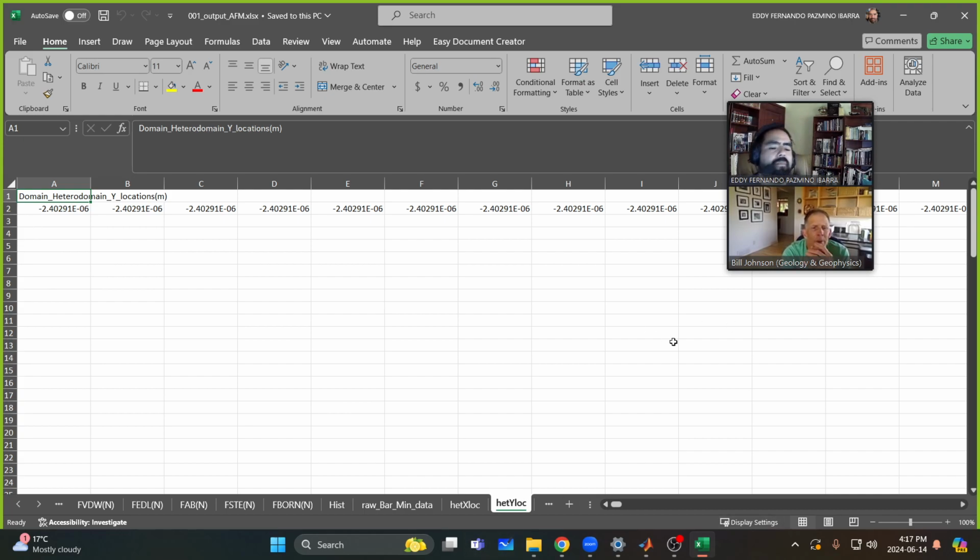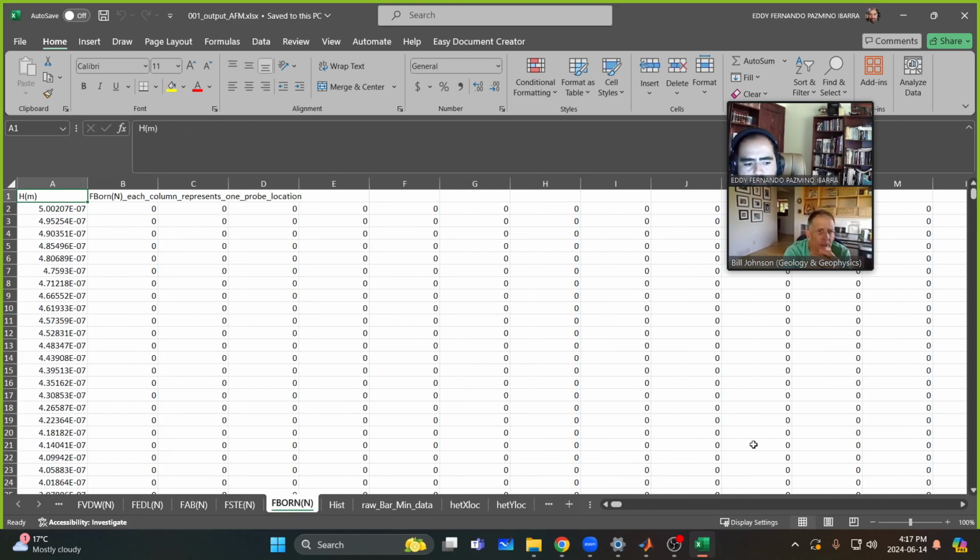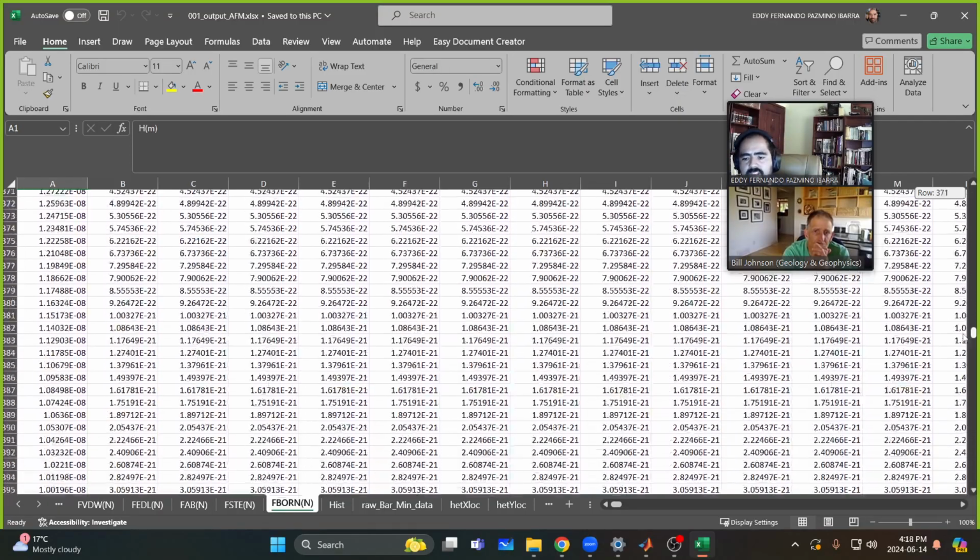If you go back to the Born worksheet, assume those values were zero because it starts far away from the surface. Born repulsion at 500 nanometers is going to be zero, or insignificant. When you go really close to the surface, it starts to show up.